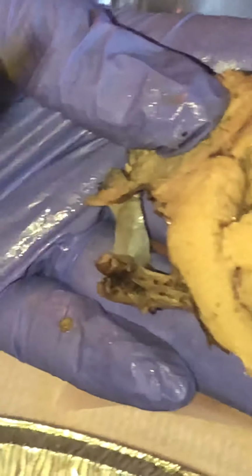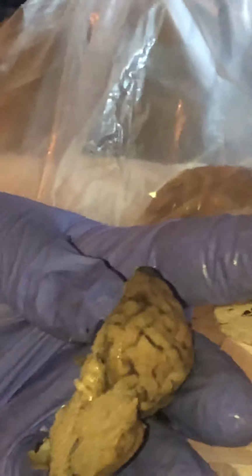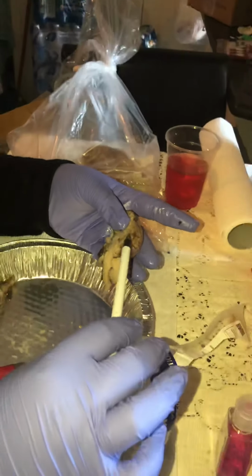So this is the hypothalamus. And the function of the hypothalamus is sleep, eating, sexual behavior, and this is the one we talked about that is located right behind your eyes. You were saying that if you want to go to sleep at night and get some rest, turn your TV off, turn the air down, so that you can get good rest.